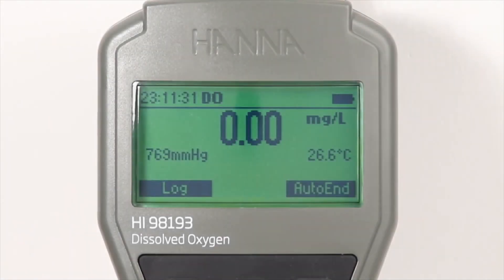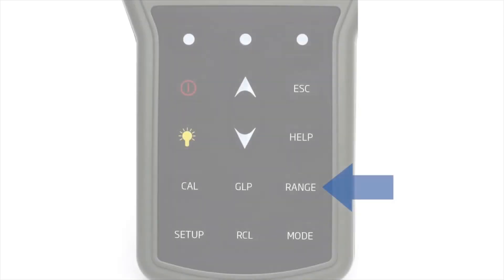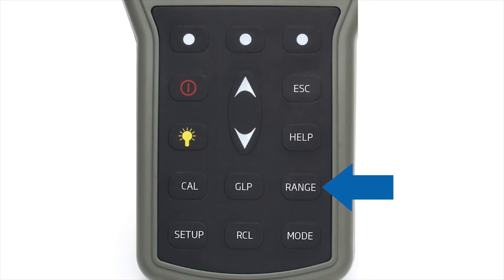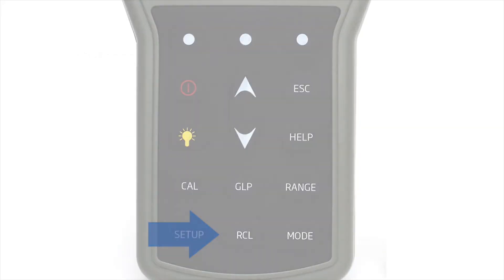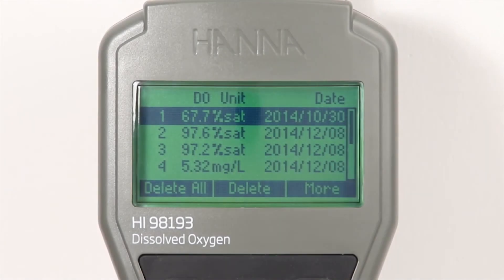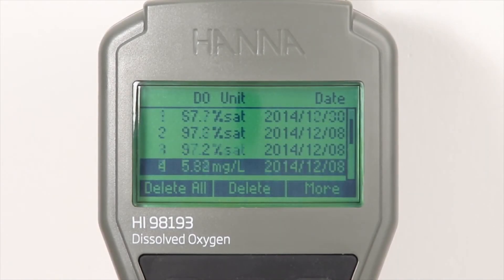To switch between DO, BOD, OUR, and SOUR modes, simply press the range button while in measurement mode. A reading can be logged by pressing the virtual log key. Stored data is easily recalled by pressing the recall button.